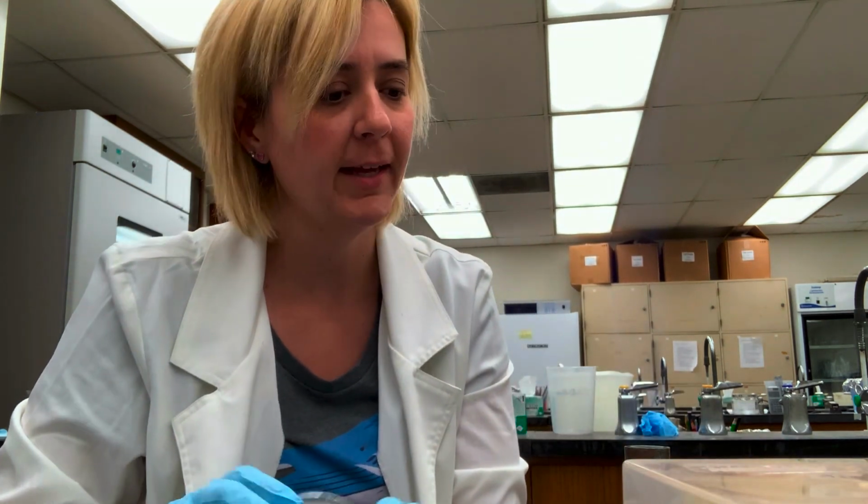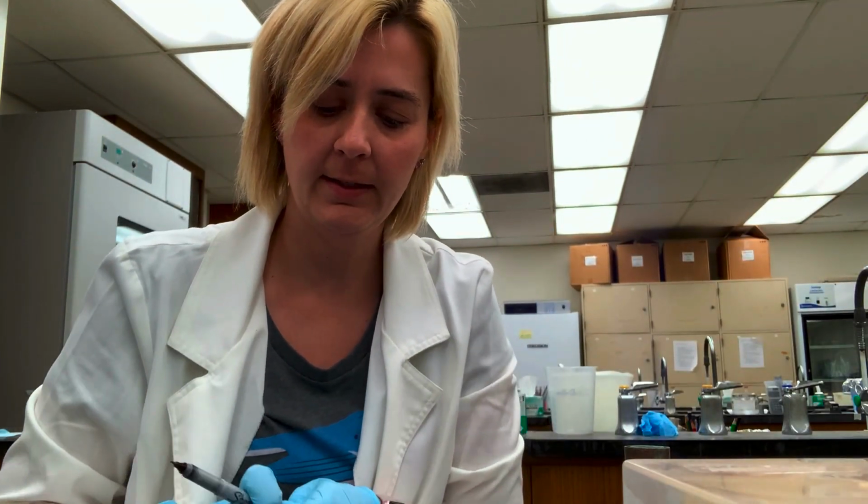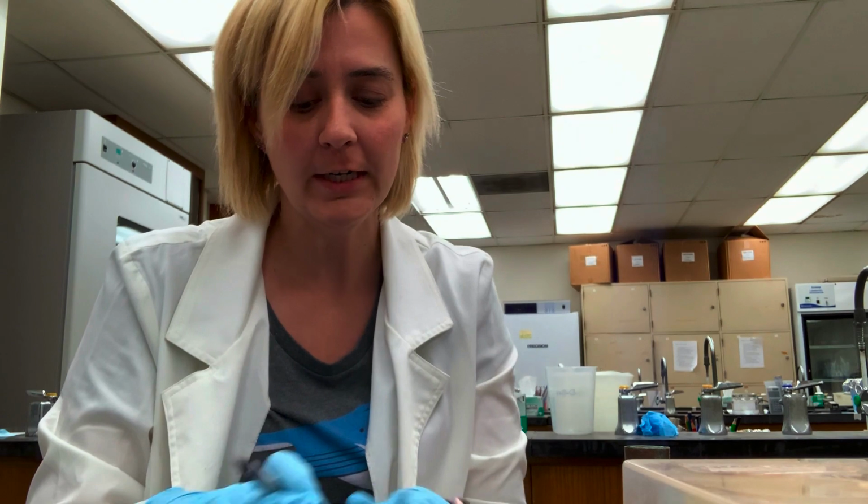Okay, so I have my lawn of bacteria plated on my plate. I am going to label my plate by cutting it into 4 even sections. Well, not so even. I'm not the best artist, but that's okay.